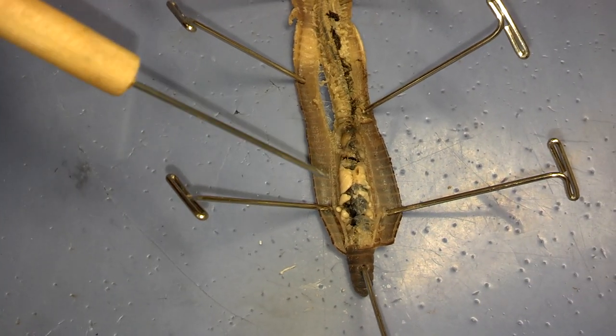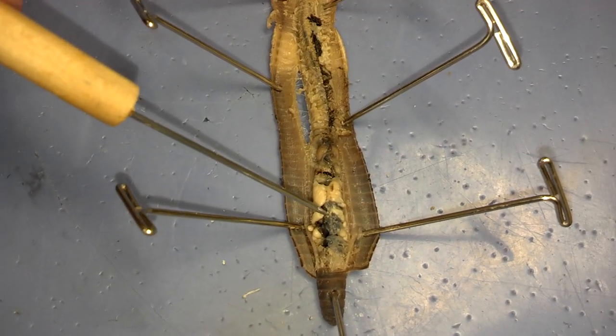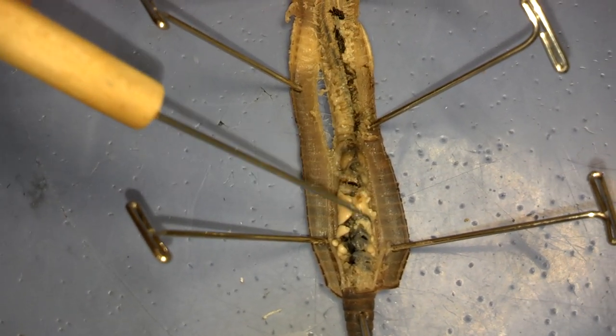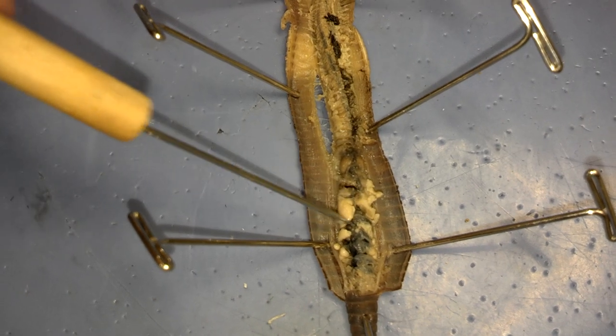The last thing we're going to look at are the aortic arches. As you know, that's the earthworm's heart. There are five sets of these aortic arches. Some of the worms have these glands — we can just remove these glands and get them out of the way.